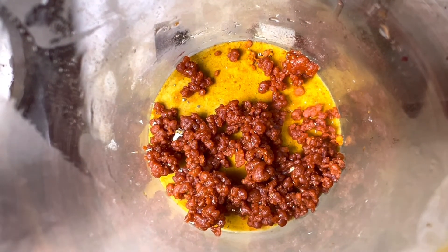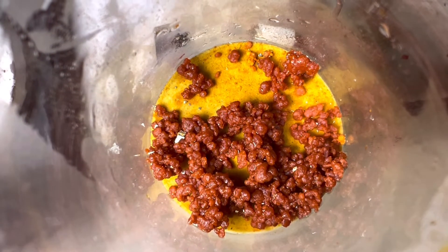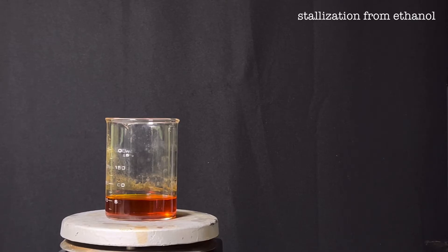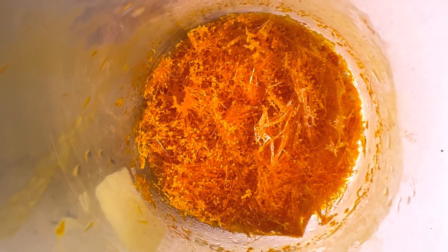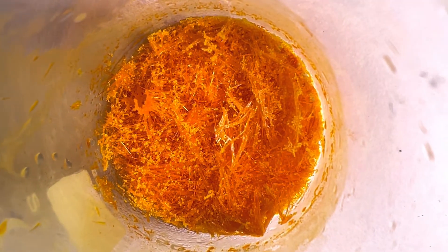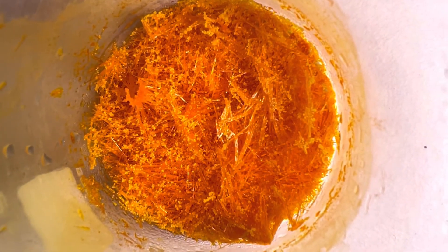Now we recrystallize it from hot 90 percent ethanol solution. On cooling in freezer overnight, orange colored needle shaped crystals of azobenzene separate out. It was later vacuum filtered and dried.